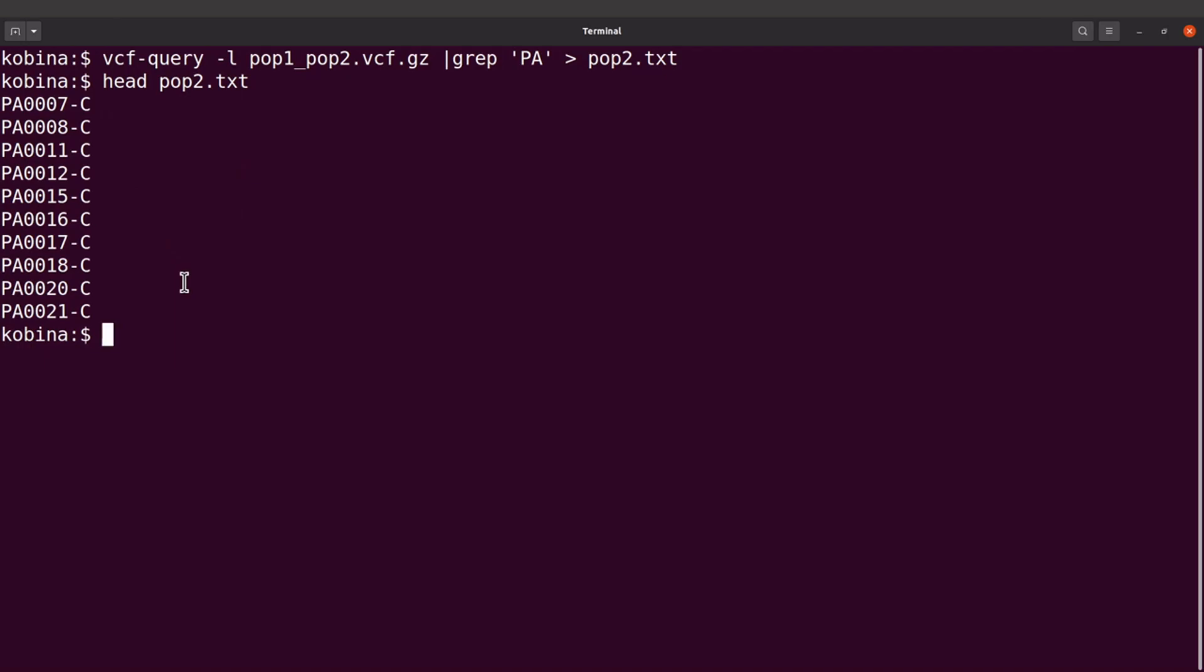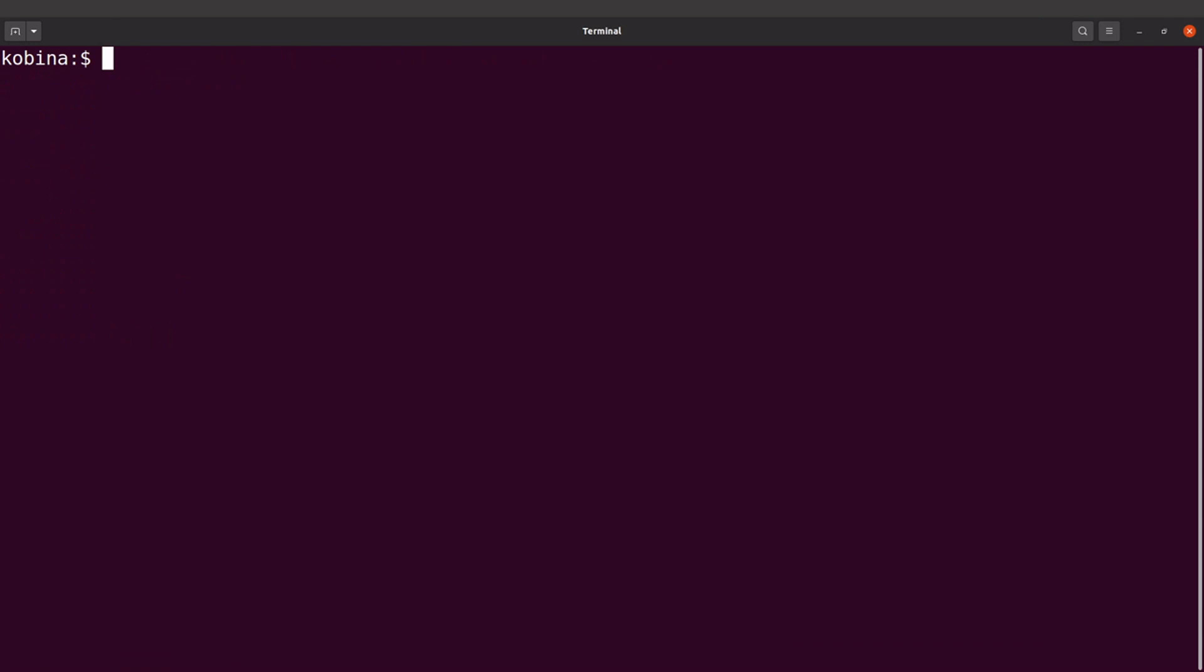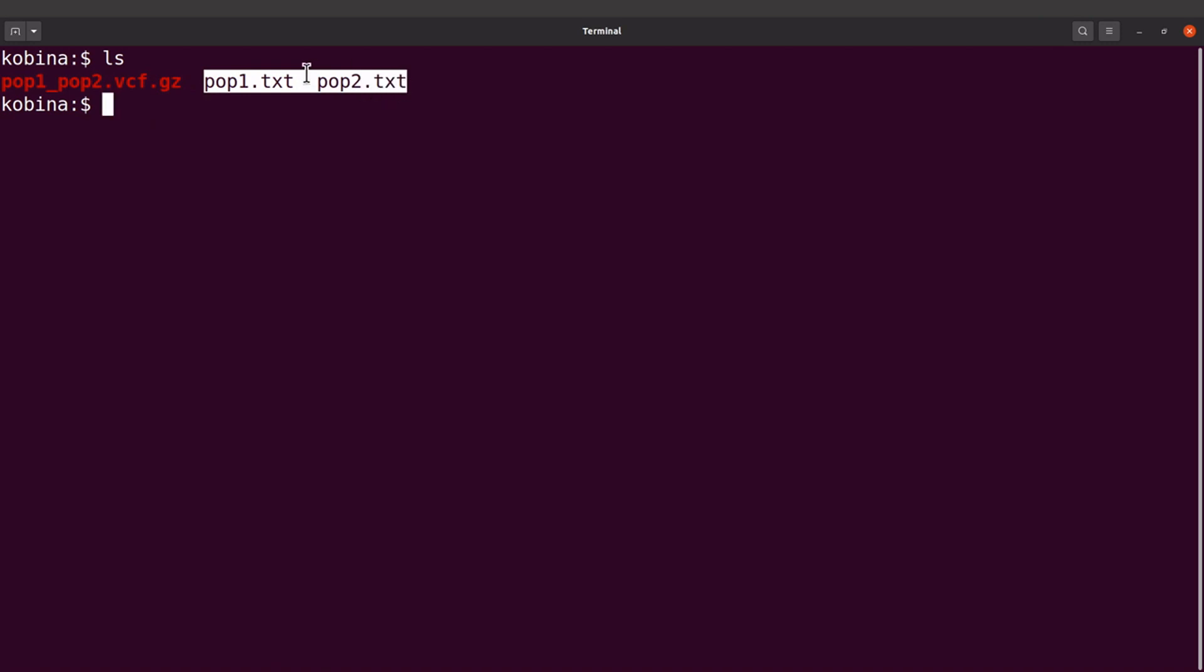Okay, so now we have both files ready. Let's check them again. So let's do an ls here. Yeah, and then you'll see these two files. So this is pop1, this is pop2. So now we have all the necessary files we need for computing the FST values. Okay, so let's proceed.